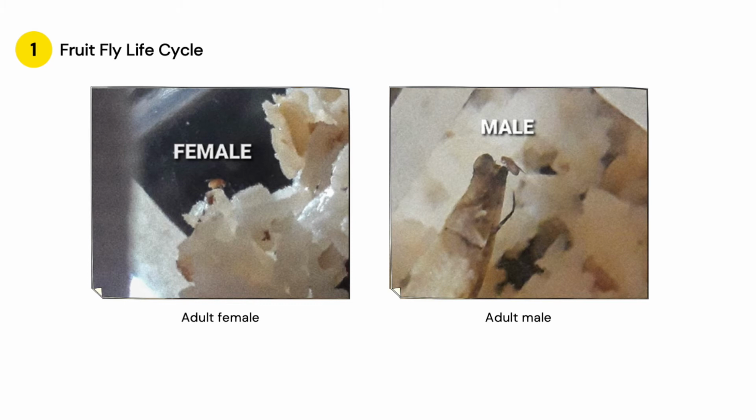Here in this slide, we see the female and male form of a Drosophila. Drosophila are also sexually dimorphic organisms, meaning that the females are phenotypically distinct from males. Males are much smaller than females, and they have darkly colored external genitalia as well as more black pigment on the lower abdomen. Males also have a patch of bristles on their forelegs called the sex combs, used to latch onto the female during copulation.